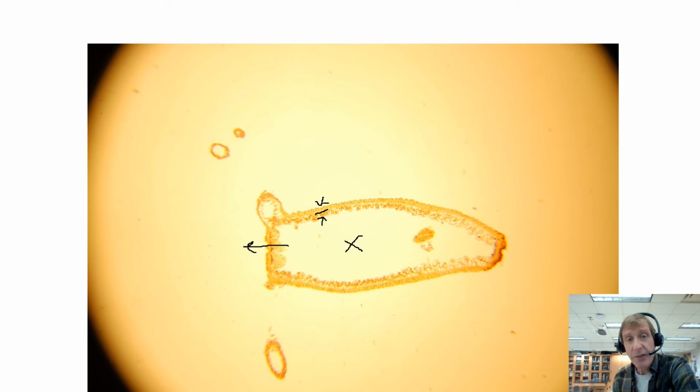I'll put a higher magnification on it a bit. These little bits are just sections through the tentacles. That's part of a tentacle. So this one, you just need to know the phylum Cnidaria. I wouldn't expect you necessarily to know the class is Hydrozoa, but it's not too bad because you know it's a hydra.